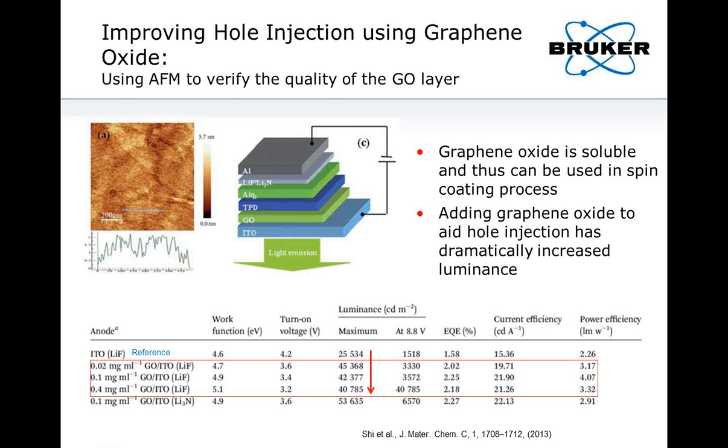And in this specific experiment here, graphene oxide was used as a hole injection layer. Graphene oxide has, for printable OLEDs, of course, also the advantage that it's solution processable and, of course, quite easily chemically tunable. And what we see on the left is the AFM used to characterize the various graphene oxide layers that were prepared on the ITO to form the LED that was then tested.